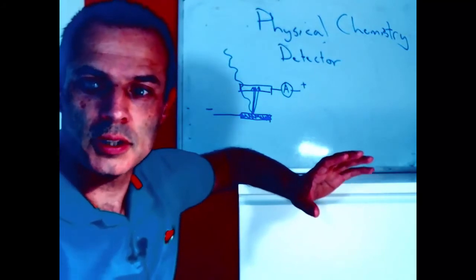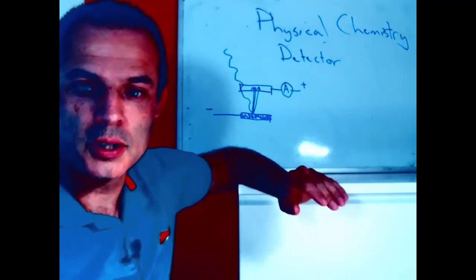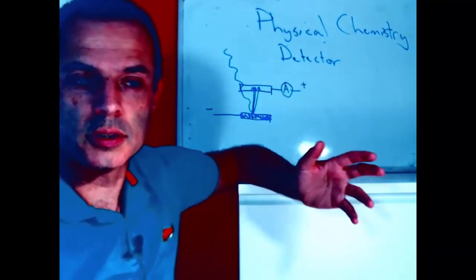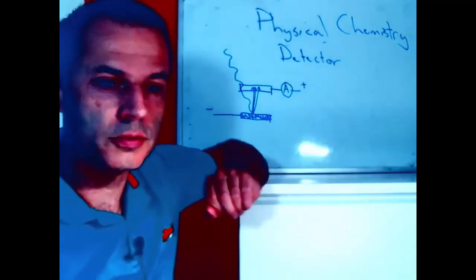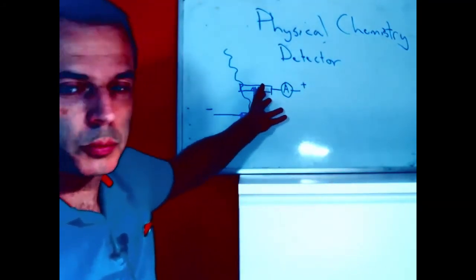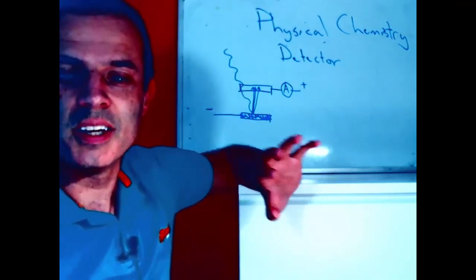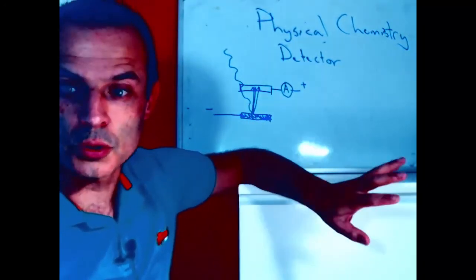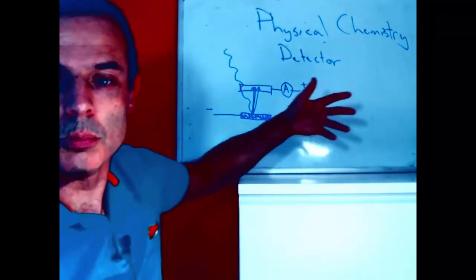There are better technologies if we need to know the energy to a higher accuracy, but those are really expensive, so they would be much more like the detectors and the measurement systems inside an X-ray UV visible spectrometer. So there would be a diffraction grating in there, and because it's an X-ray, it would have to be a bent crystal. Those are expensive. And then we would have a whole range of detectors to measure them.